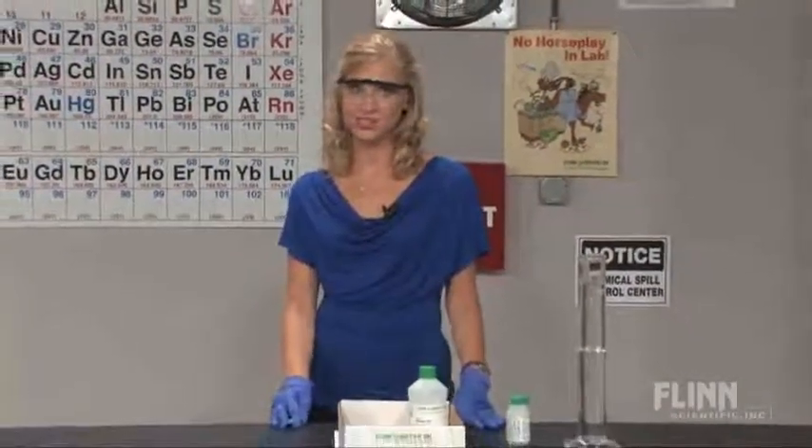Sodium and water produce a violent reaction that flashes right before your eyes. This scares teachers away from performing this demonstration in their classrooms. Flynn has a much easier, safer way to perform this simple oxidation-reduction reaction.